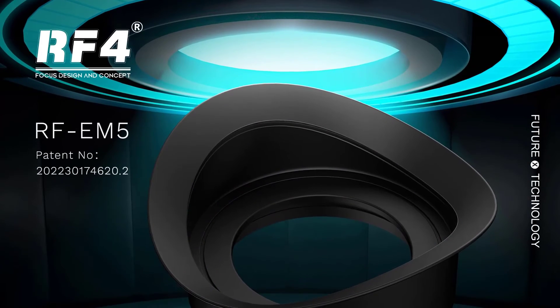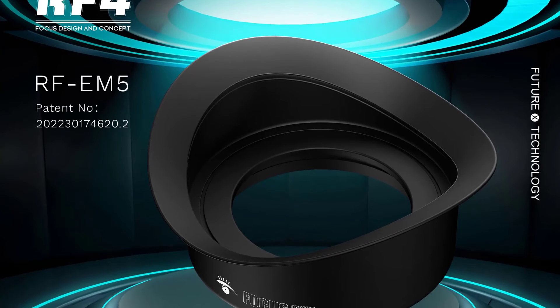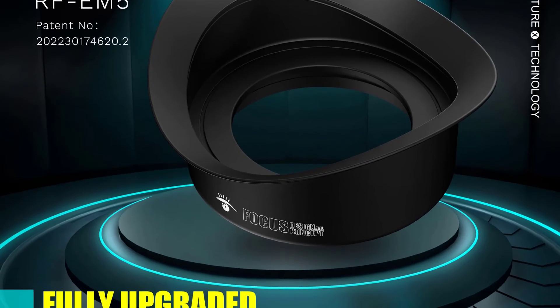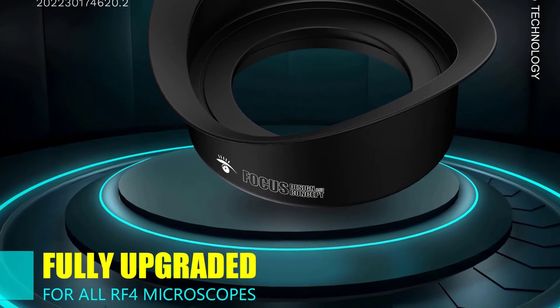One of the standout features of this microscope is its portability. It is designed to be handheld and is exceptionally lightweight, making it easy to move and set up wherever needed. The metal construction ensures its durability, with the microscope holding up well under regular use.